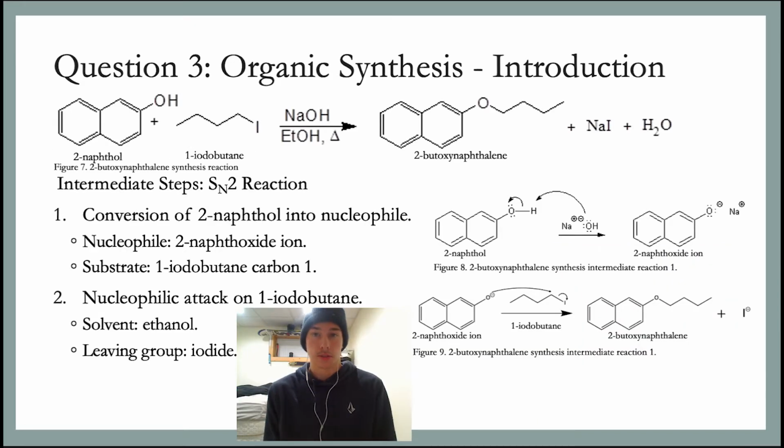So for question 3, I'm going to start by briefly discussing the reaction involved in the synthesis of 2-butoxynaphthalene. Later I'll more thoroughly analyze the reaction mechanism. This is just to help understand the procedure. So this is an SN2 reaction. I will explain why later, but what this means is that the nucleophile is attacking the substrate as the leaving group leaves. A nucleophile is a chemical species that donates an electron pair to form a chemical bond.